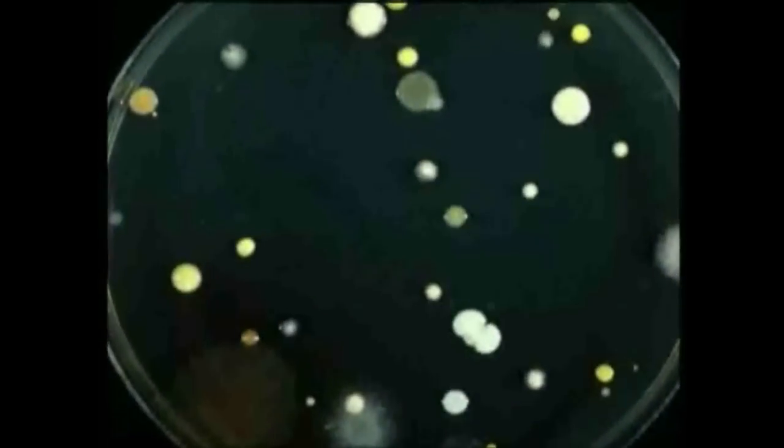The uplift of air carrying microorganisms away from the immediate area is another reason why all microbiological work is carried out near a Bunsen on a roaring flame. The convection current helps prevent aerial contaminants from falling onto where you are working.